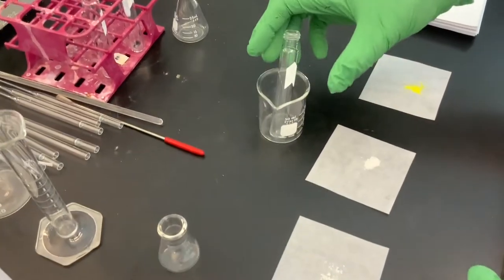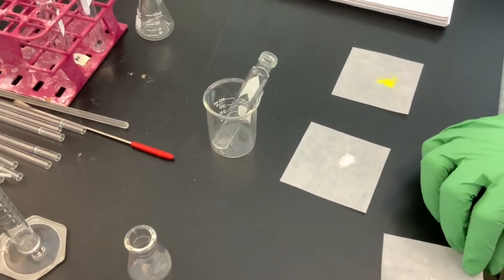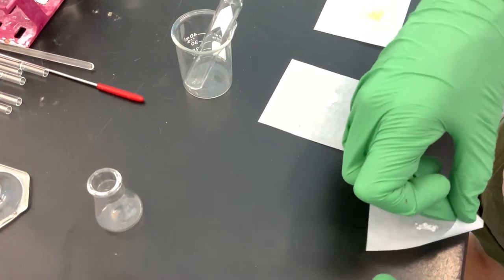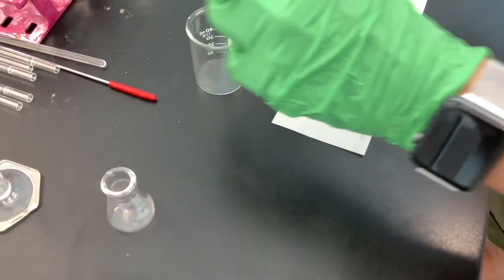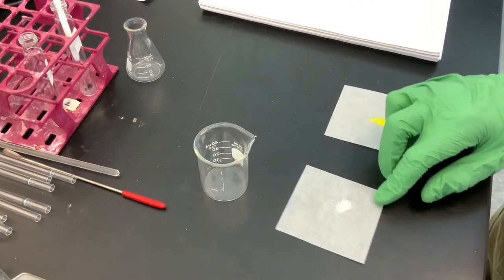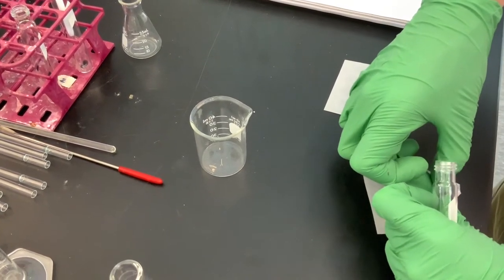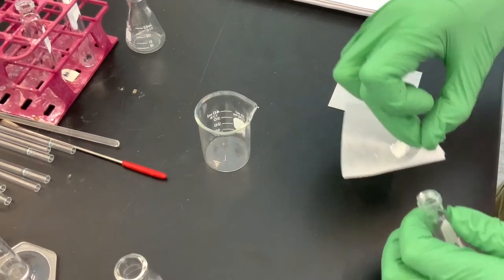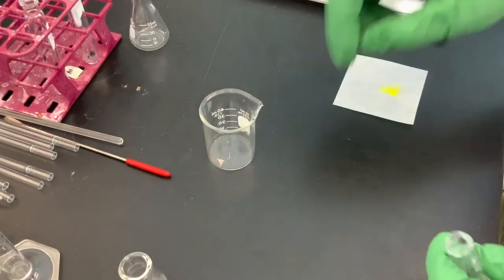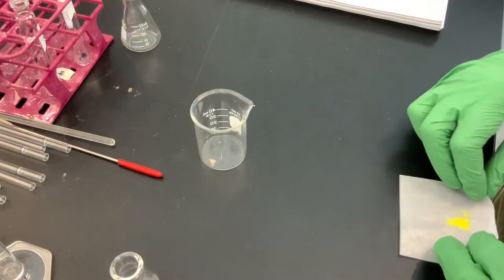Use the 50 milliliter beaker just to help hold it up. So I take the 2 edges, remember, and I make a little cone to help me transfer the solid into the culture tube. So that was our acid. Our base. And then lastly, our neutral compound, which will always be dissolved in the organic layer.